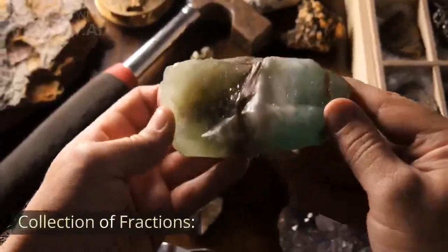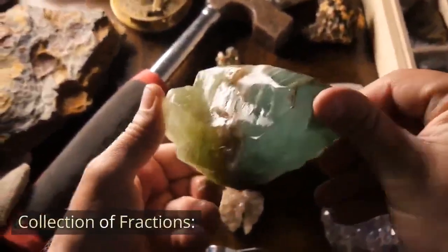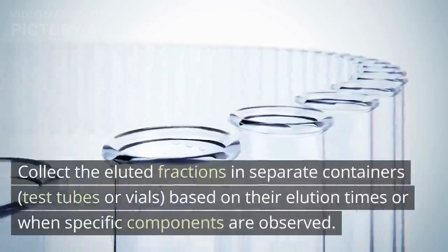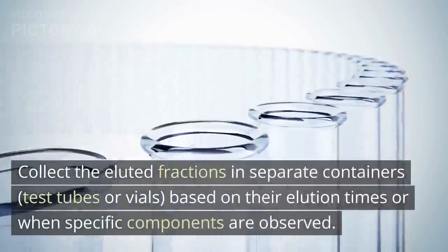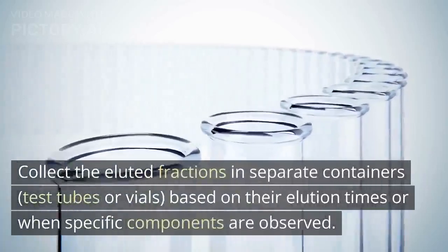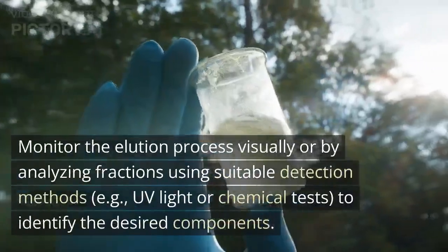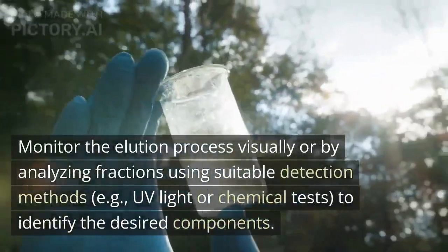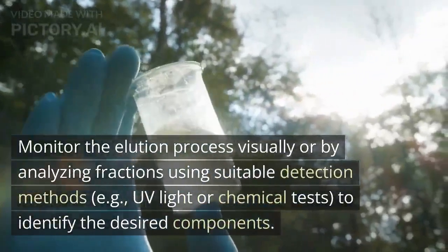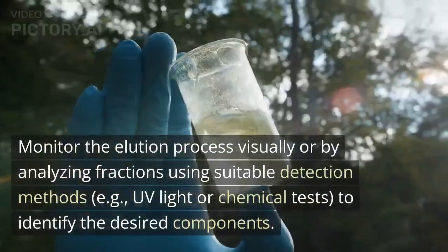Collection of fractions. Collect the eluted fractions in separate containers, test tubes or vials, based on their elution times or when specific components are observed. Monitor the elution process visually or by analyzing fractions using suitable detection methods, e.g., UV light or chemical tests, to identify the desired components.